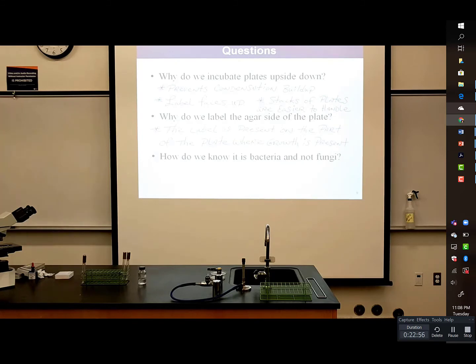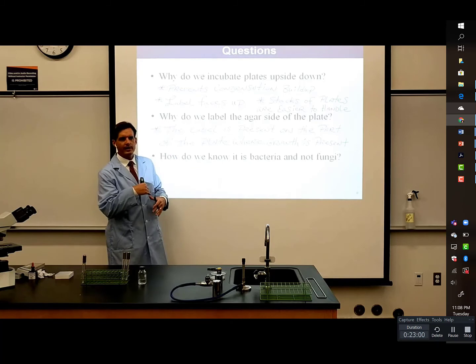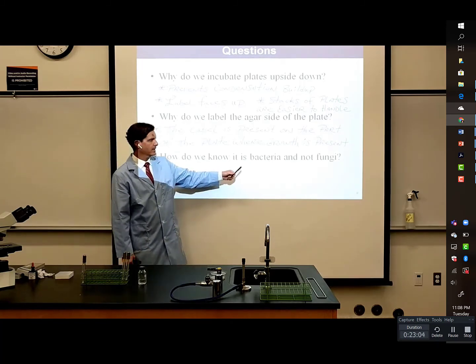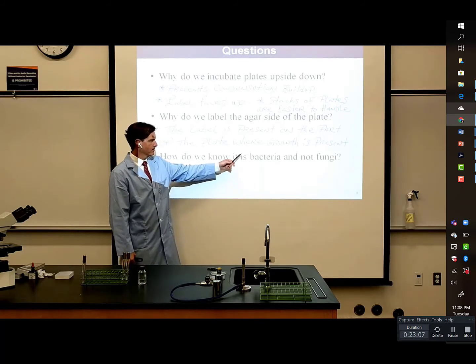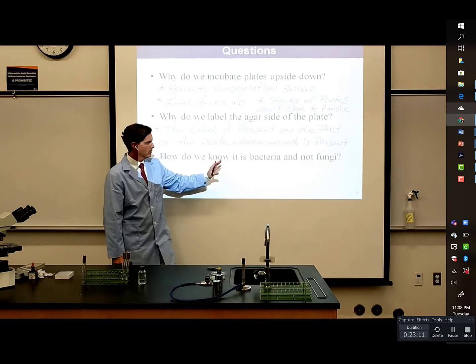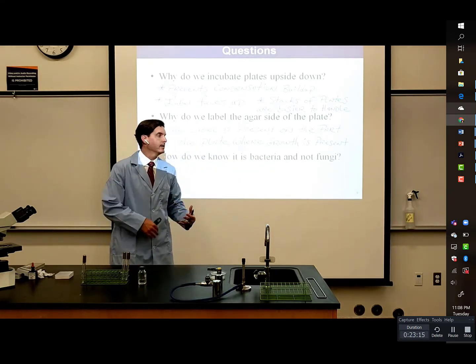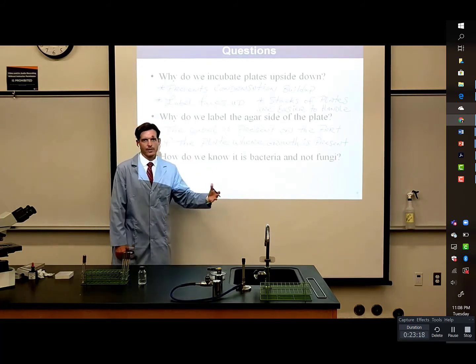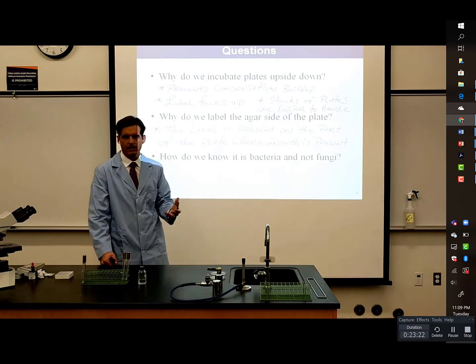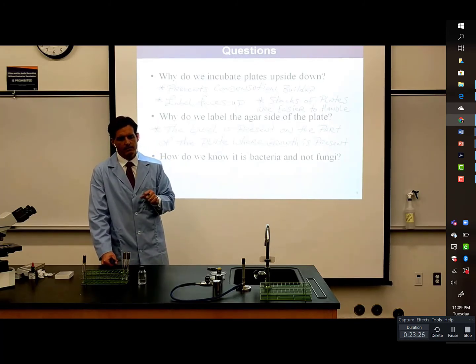And then this last question will be partially answered next time, but it says here, how do we know it is bacteria, not fungi? Actually, maybe the wording here could be that the bacteria are likely what we're going to be growing out of our samples, more so than fungi. And this has to do with how long we're incubating for, which is going to be a couple days. So I'll be back a couple days from now to take those plates out.